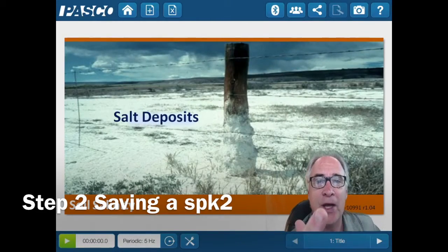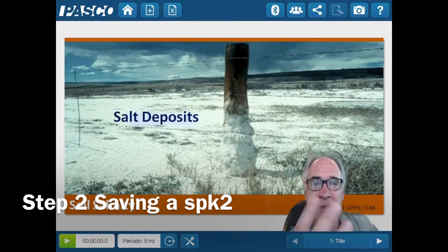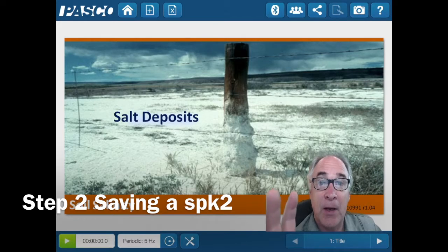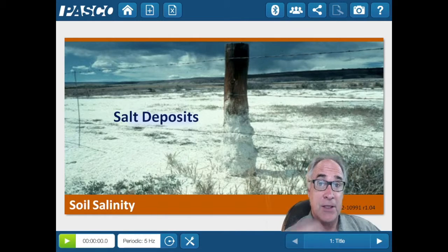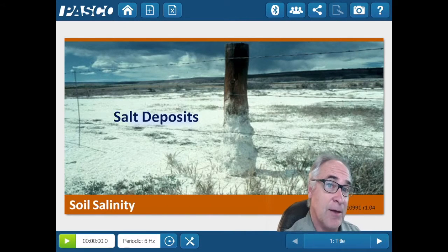This is a continuation of a 4-part series on how to upload a SparkVue file, how to save it on your device, how to save it to your Google Drive account, then also how to send it to your Google Classroom account. So it's a 4-part series. This is the second part of that 4-part series.